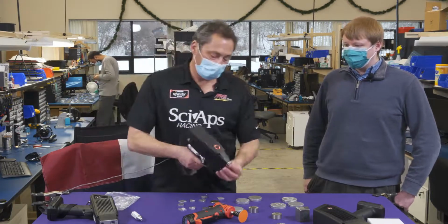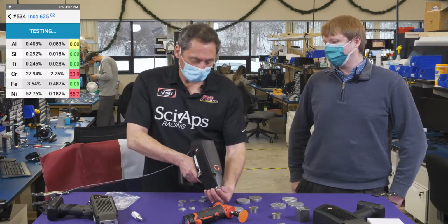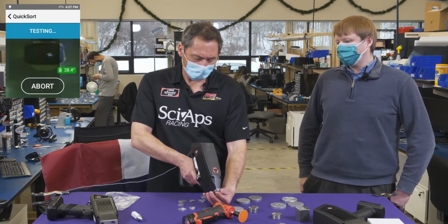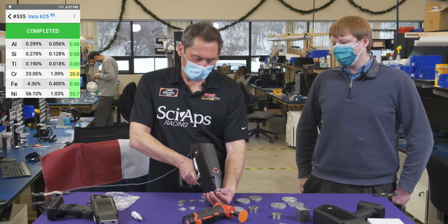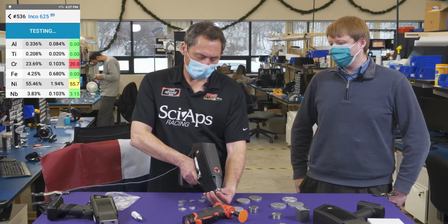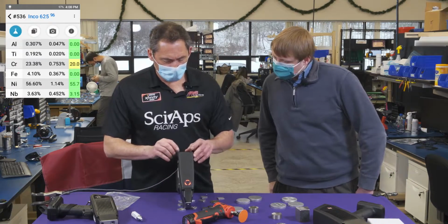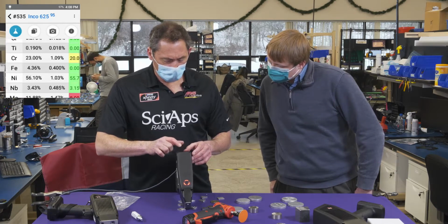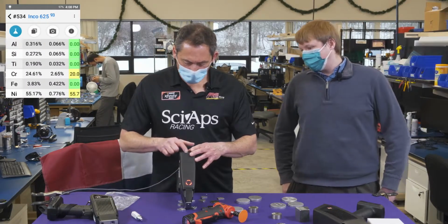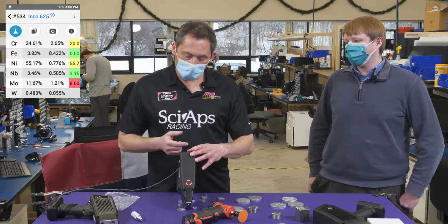Let's try a nickel alloy. What do you think? Let's try 625. See, matches it all the time. Okay, let's see. What do you think about nickel now? Let's see. 56.6, 56.1. You did a really nice job with this. Yeah, nickels are tough with LIBS, nickel alloys. All right. 55.2. So again, you know, X-ray is going to be more precise, but that's still pretty good for air shots.